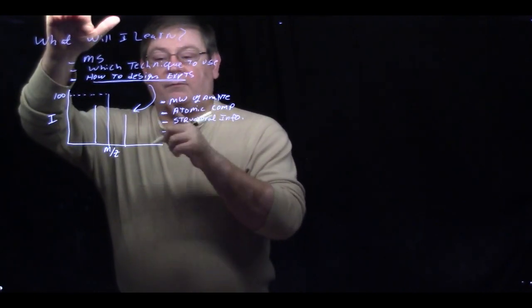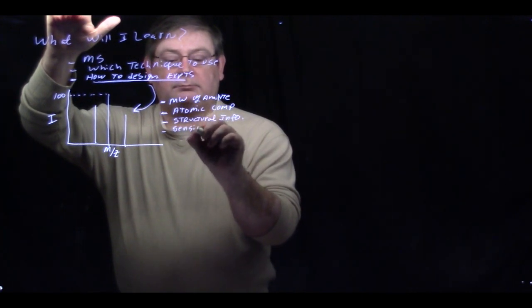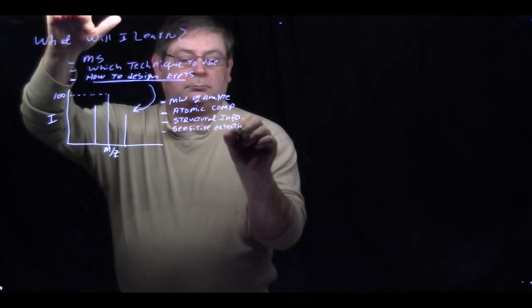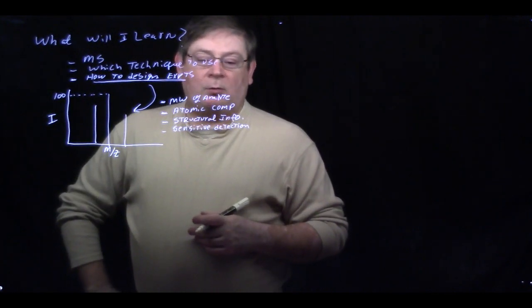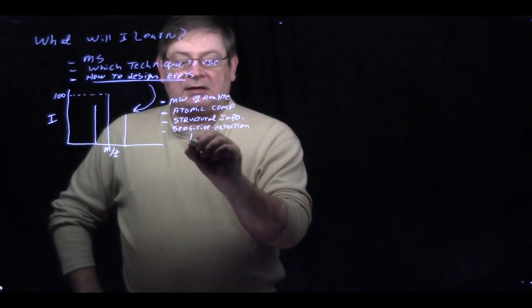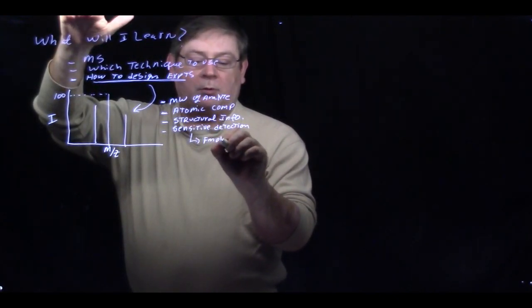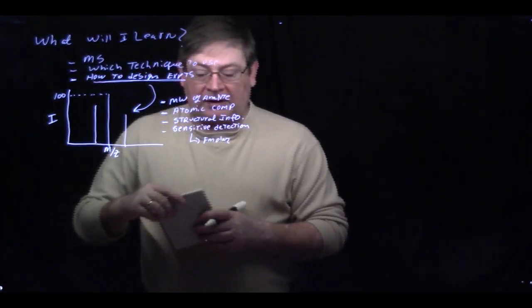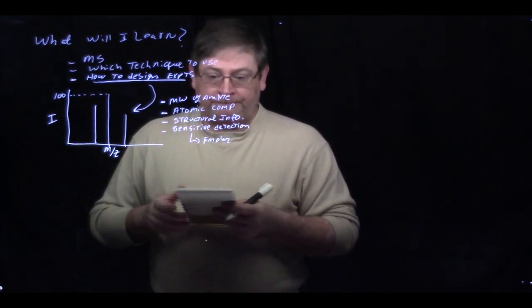And you also get, from mass spec, very sensitive detection. Mass spec is one of the most sensitive techniques that we have available to us as chemists, and we can actually get sensitivities down to easily the femtomolar range. So you can get down to femtomolar with mass spec pretty easily, and so it is one of the more sensitive techniques that we have at our disposal.